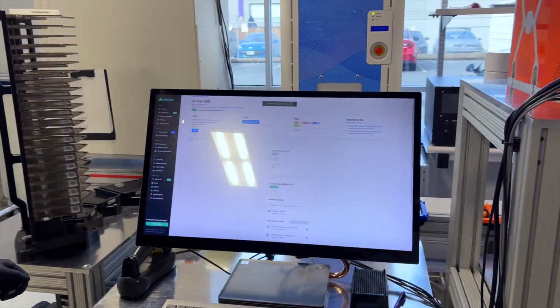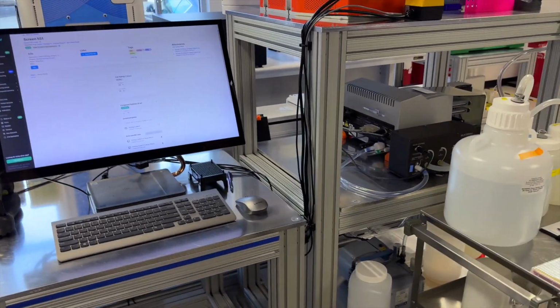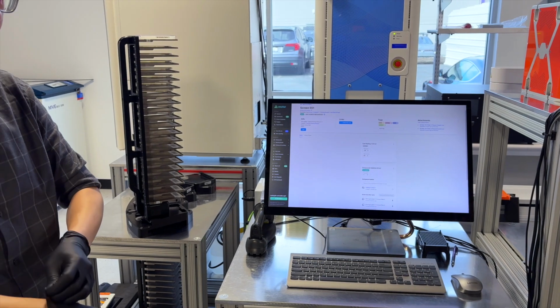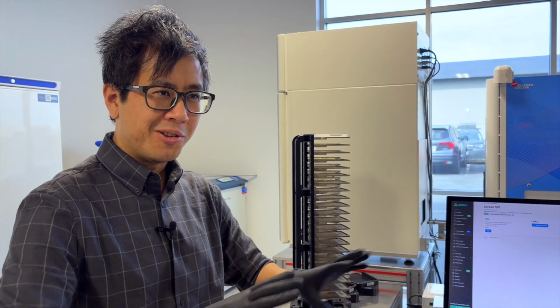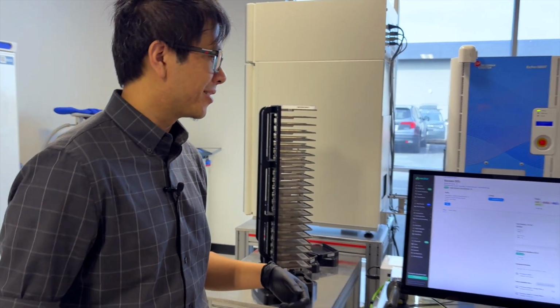And so this is our LIMS vector. Again, it was completely made in-house. Back end is Ruby on Rails. Front end is Next.js. Really handy thing. It's all built on a GraphQL API, and so that also makes it a lot easier for some of our AI agents to kind of just discover what kind of APIs are available and automatically search through stuff so humans can ask natural language questions and get structured answers back from our LIMS.